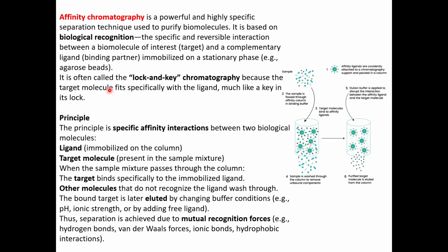So agarose beads, sepharose beads, sephacryl beads, many different varieties of beads are available based on the type of sample, based on the type of target, tags, binding, and type of purification that you require, and the downstream use of your sample. You can choose the material of interest and go ahead with the purification.